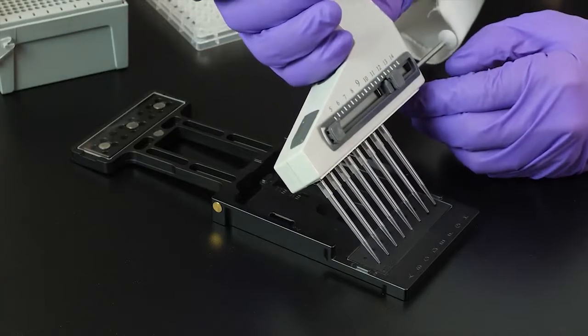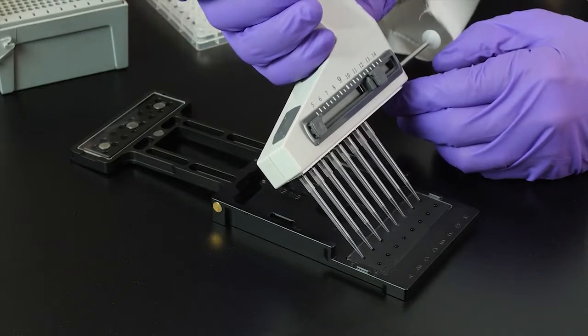Micro-volume analysis with Biotek's Take-3 plate in Synergy LX is fast and easy, too.